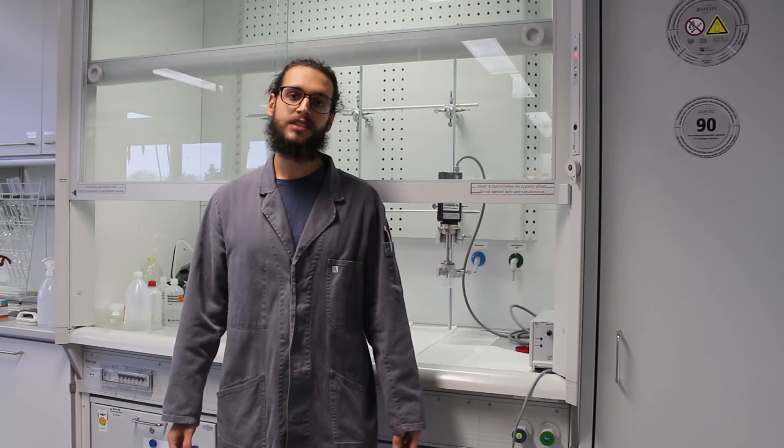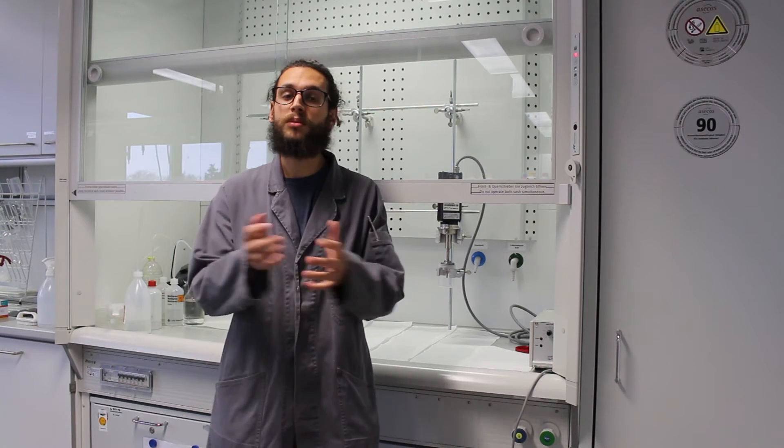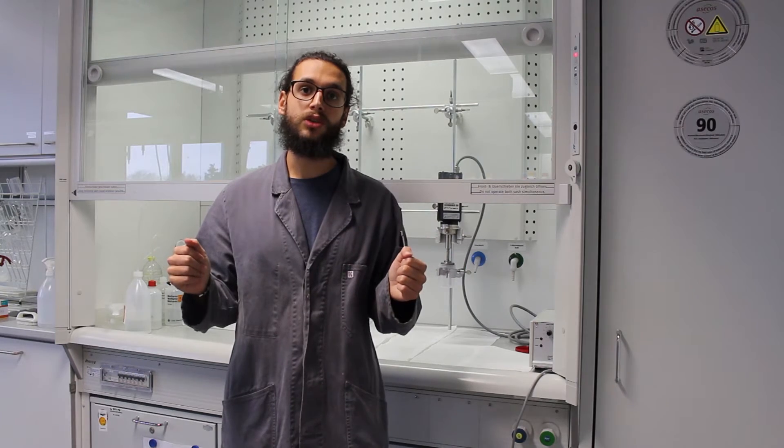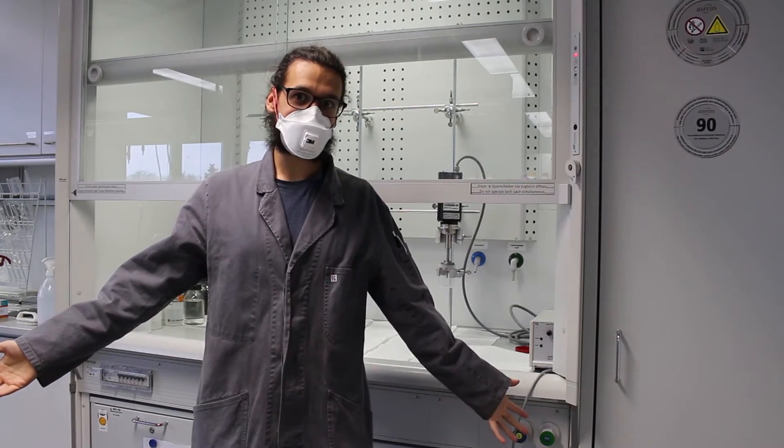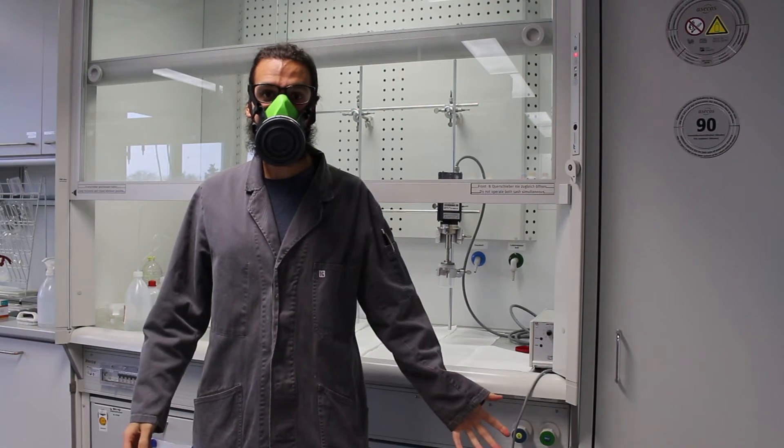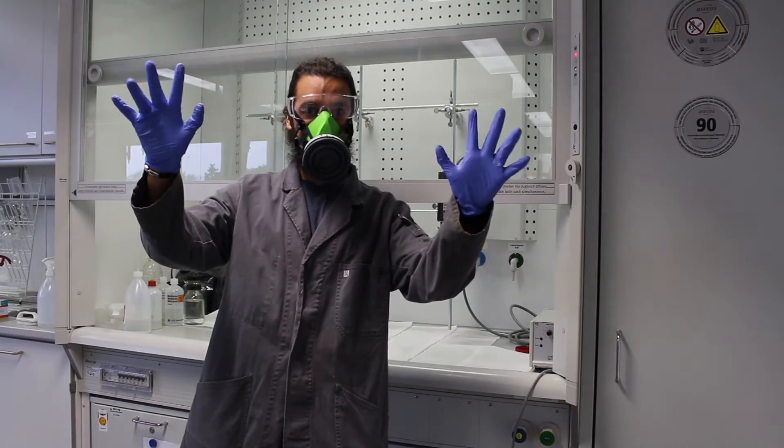So today I'm going to show you a little experiment just for you to understand what it means to be small in practice. And also some really small safety precautions. So if you want to work with nanotubes, you should wear, for example, a mask. Like this one. Or like this one, which is even better. And good glasses too, of course. And gloves.